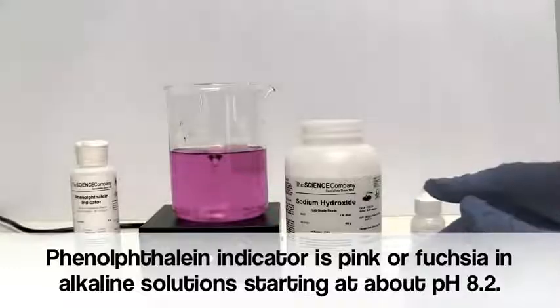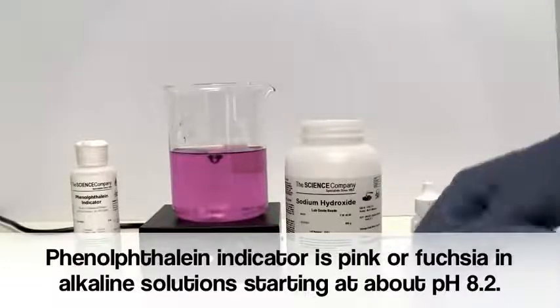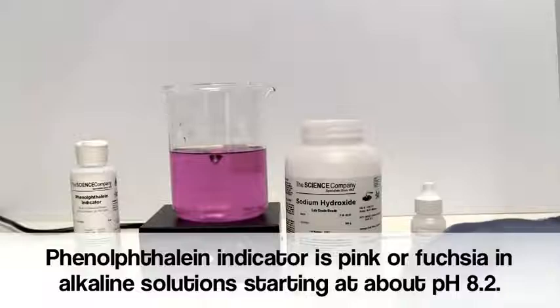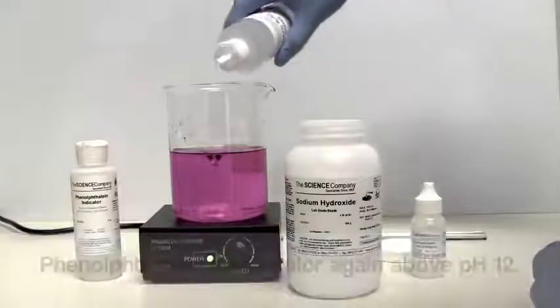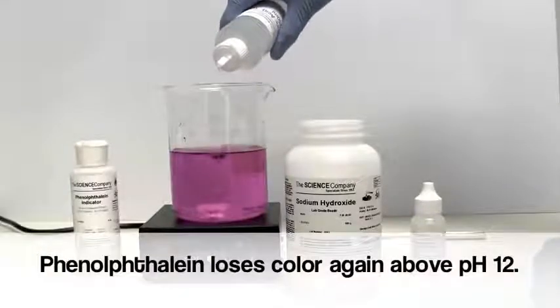Phenolphthalein will be colorless in neutral and acidic solutions. It begins to turn pink at about pH 8.2 and turns dark pink or fuchsia at pH 10. In strongly alkaline solutions above pH 12, phenolphthalein loses its color again.